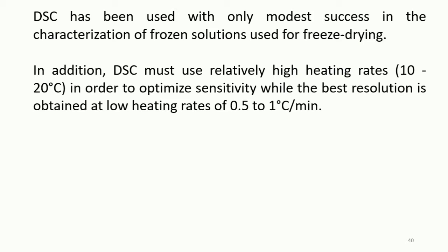In the introduction section on new differential scanning calorimetric technologies, it was explained how modulated differential scanning calorimetry has both an average and modulated heating rate.